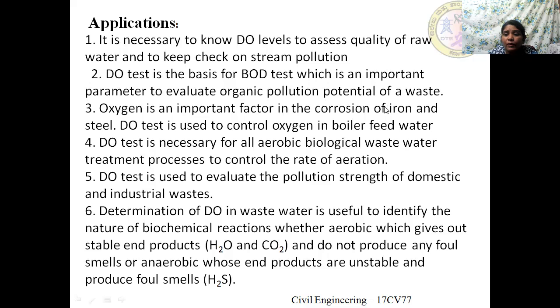And the difference between the DO, that is the dissolved oxygen level, gives us the BOD, after an incubation of 5 days at 20 degrees Celsius. So DO test is the basis for this BOD test, which is an important parameter to evaluate the organic pollution potential of a waste.